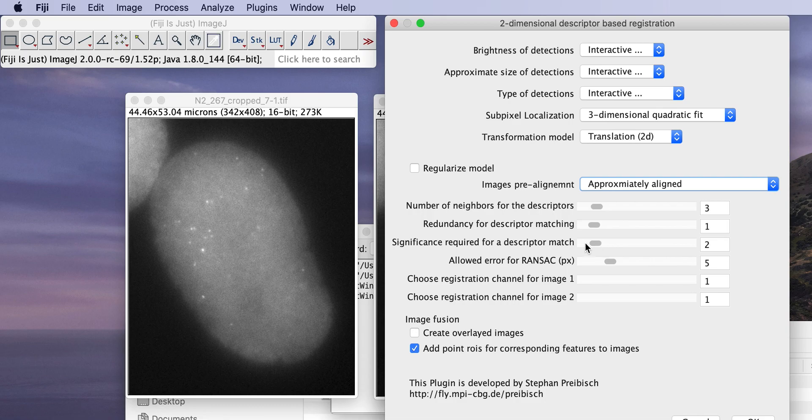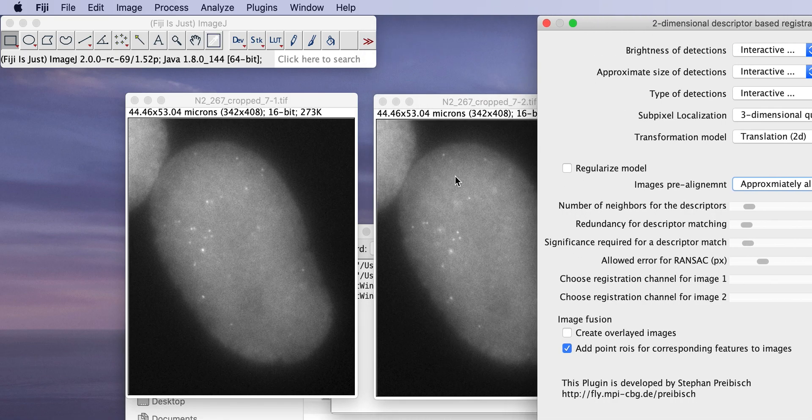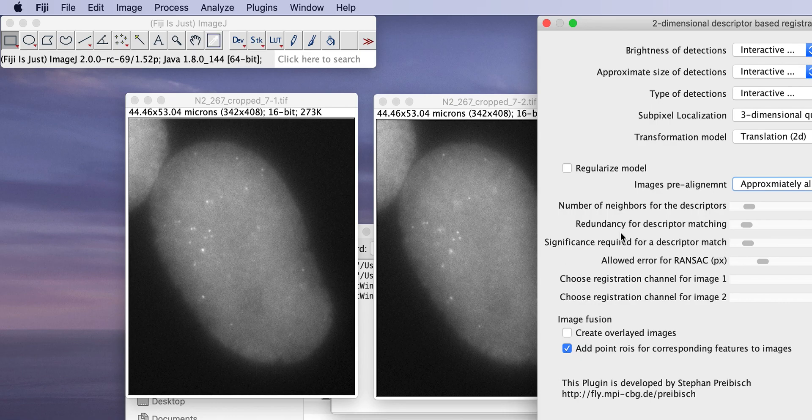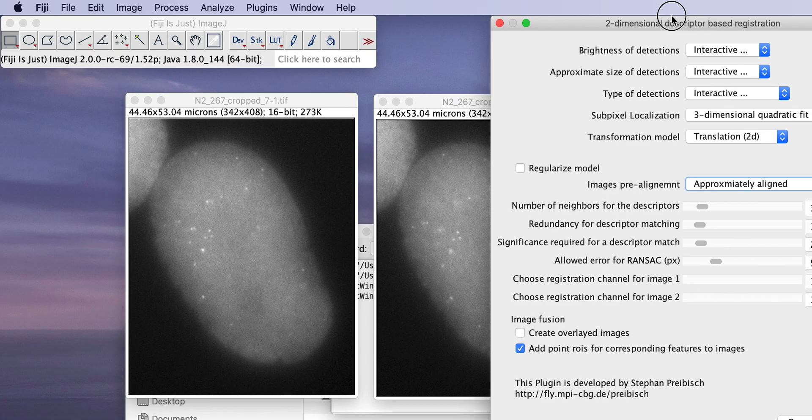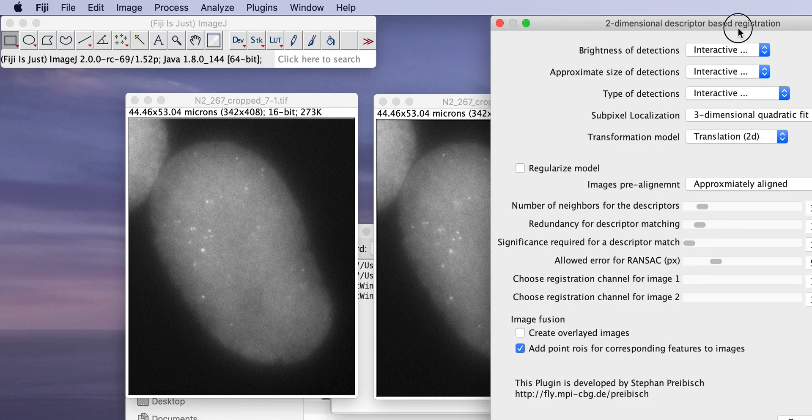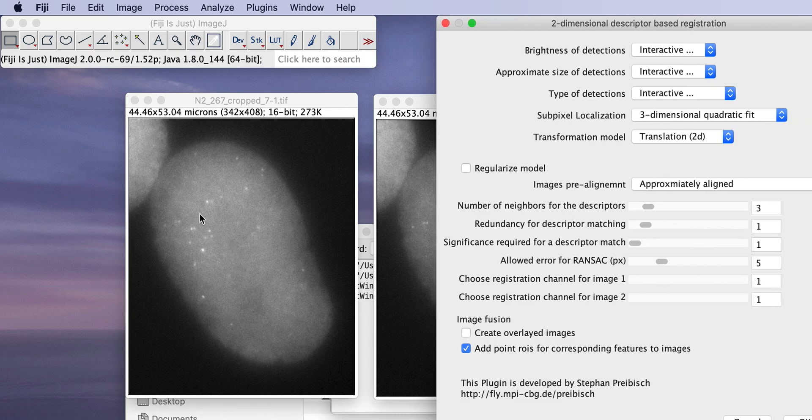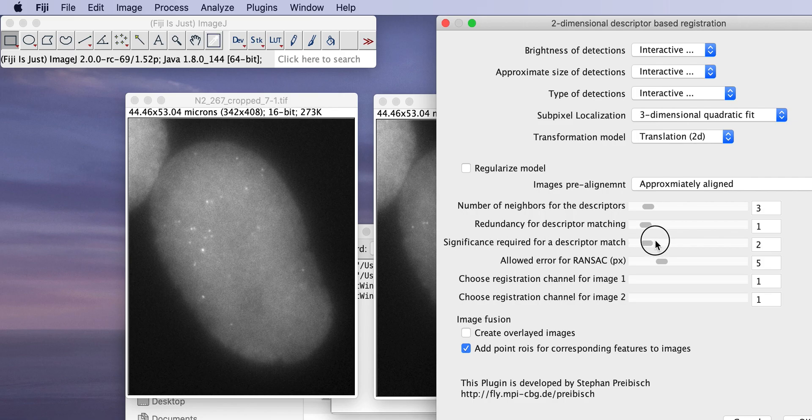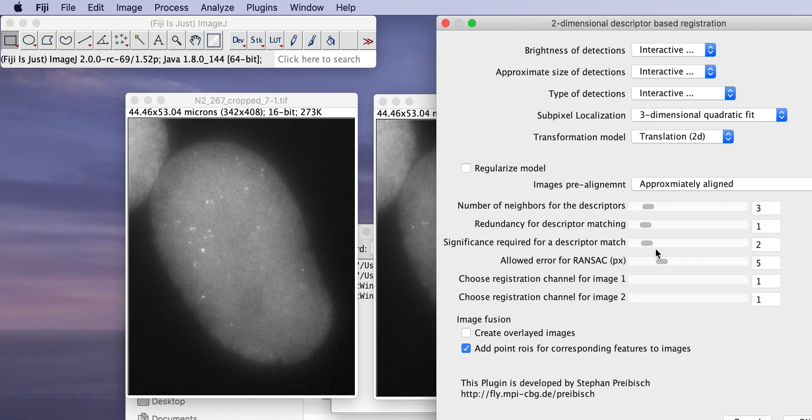The significance defines how to look for corresponding points. So it tries to find corresponding constellations of points and it always finds the best and the second best one. And the significance basically says for everyone to be considered to be a corresponding point, how much better does it have to be than the second best one? If you choose one, that means it will just take for every point whatever looks best. Usually you want it at least to be twice as good so you can filter kind of a lot of potentially wrong matches. But again, this depends on what you want to align. Usually two is a very sensible parameter.